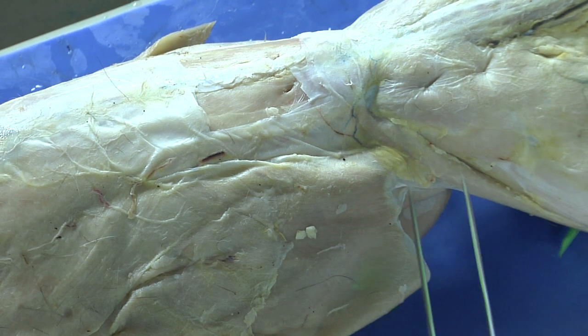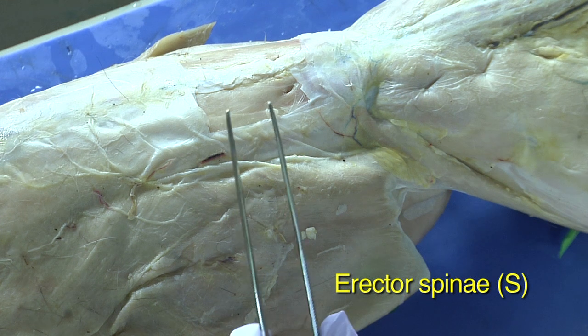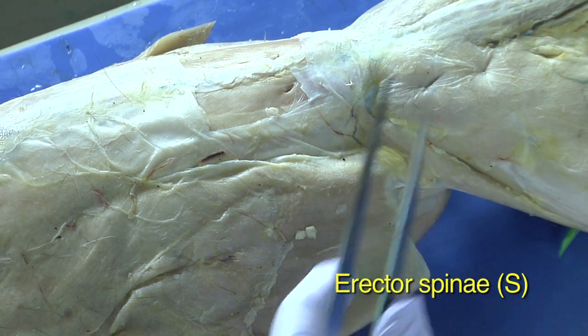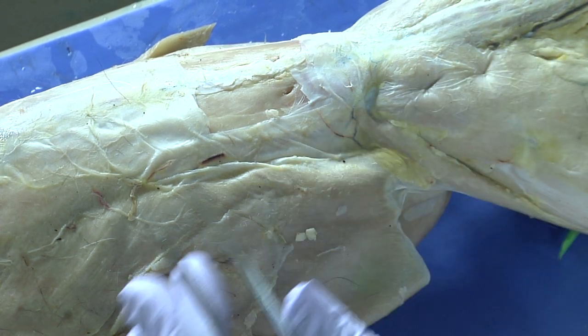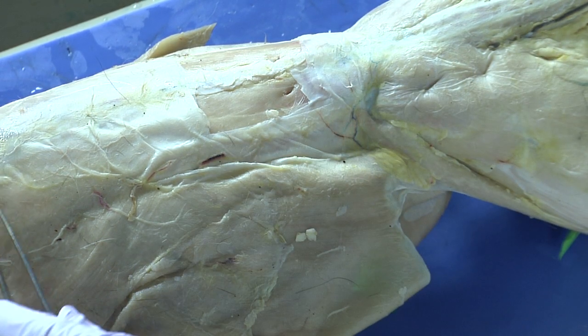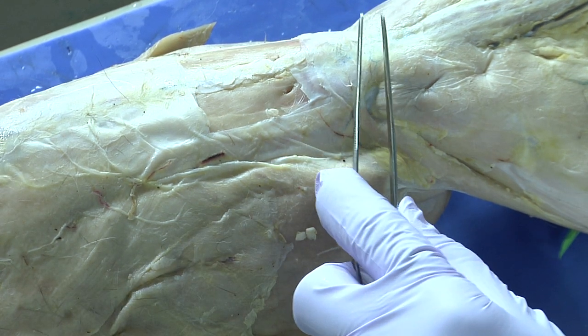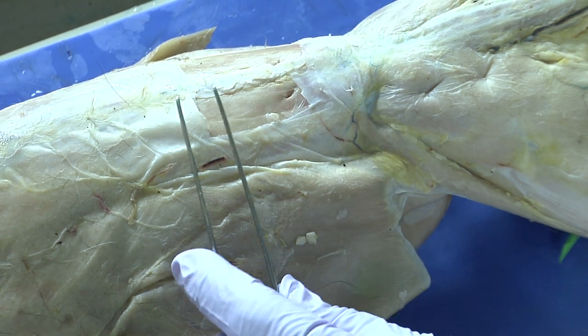Now we're going to look at the muscles along the spine. These are going to be the erector spinae muscles. These are actually a group of several muscles that run along the dorsal side of the cat right along the spine, hence the name erector spinae. These muscles are responsible for helping us to maintain posture.